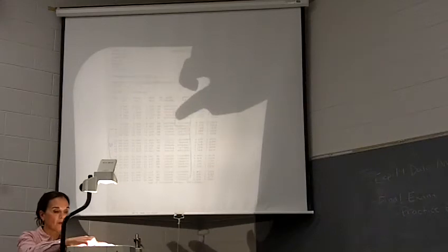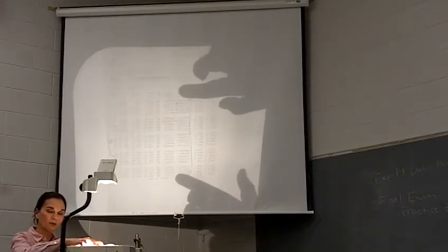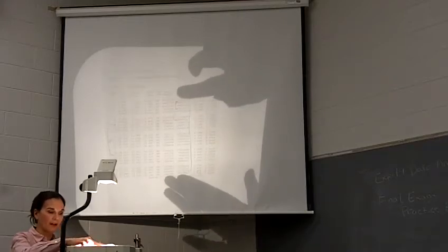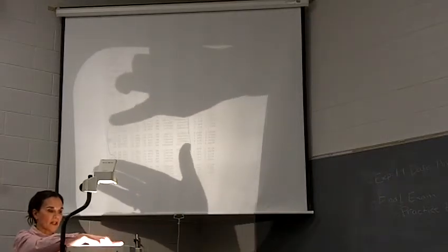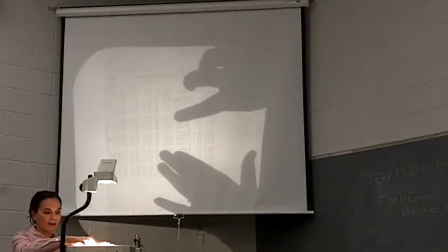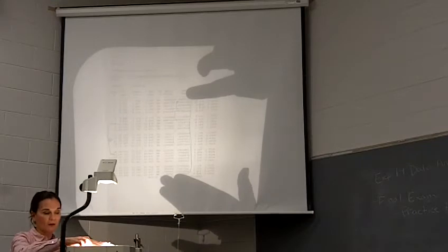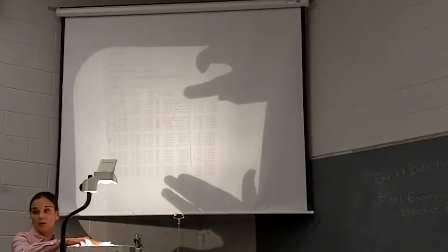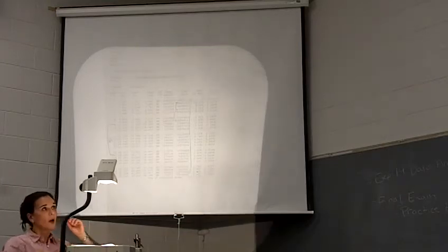Then the isopropyl toluenes, these 3 will add together and divide by the whole total area. The propyl toluenes, you'll add these 3 together and divide by the whole total area. And then you'll get to your dialkylated, add their areas together, divided by the whole total. And the trialkylated, their areas together, divided by the whole total. Does everybody see that? Okay.